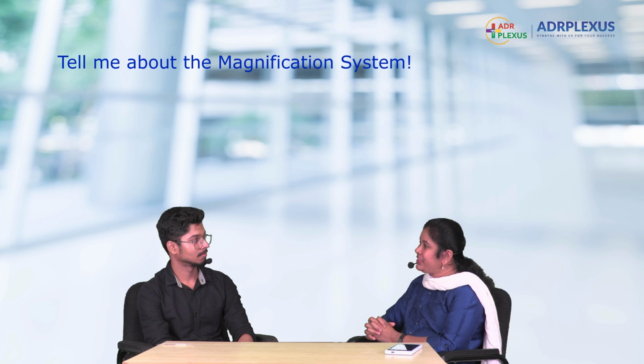Tell me about the magnification system, Naveen. For the magnification, we have the lenses, ma'am. 3 powers of lenses: 10x, 40x, and 100x. 10x is the low power, 40x is the high power, and 100x is the oil immersion, a highly magnified image.